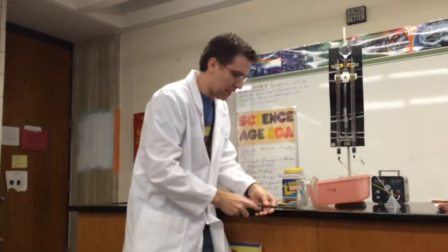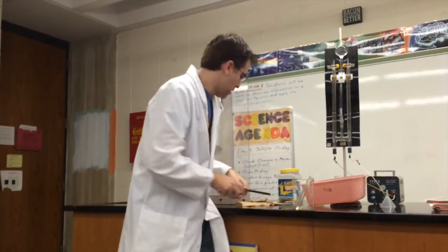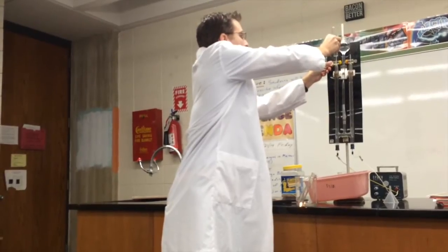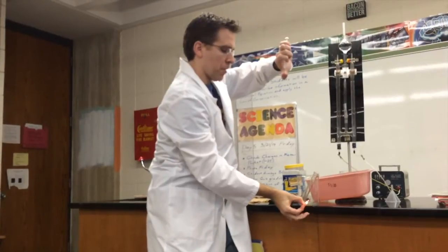What I'm going to do is I'm going to light a splint, and I'm going to take a whole test tube full of hydrogen, and then we'll see if there's a reaction.